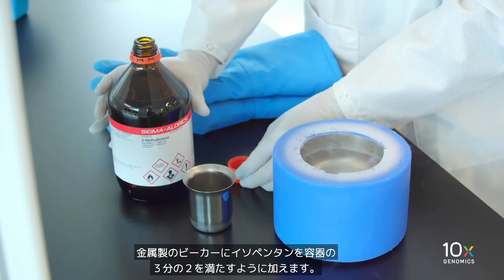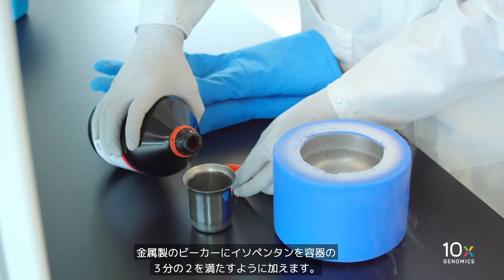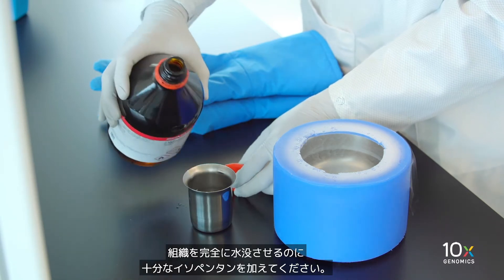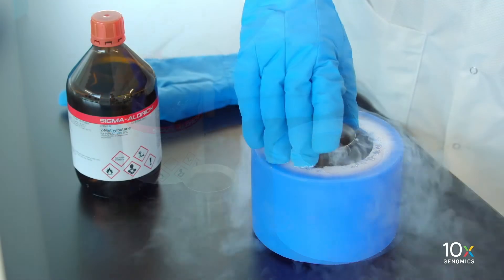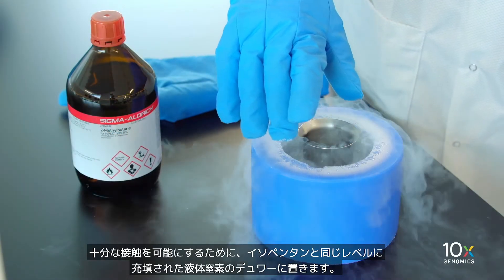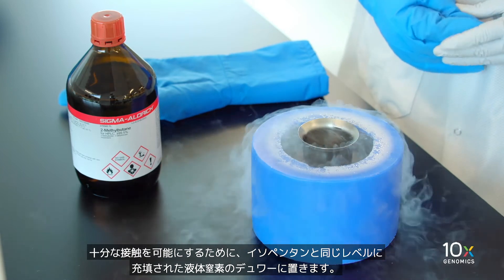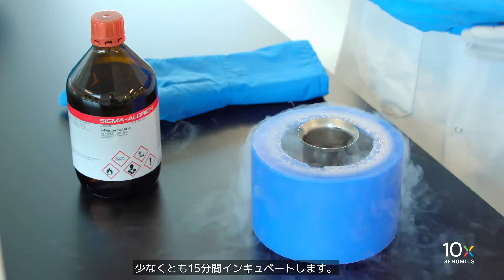First, we will prepare the isopentane and liquid nitrogen bath. Fill two-thirds of a metal beaker with isopentane, making sure you add enough to fully submerge the tissue. Place in a dewar of liquid nitrogen filled to the same level as the isopentane to allow sufficient contact. Incubate for at least 15 minutes.